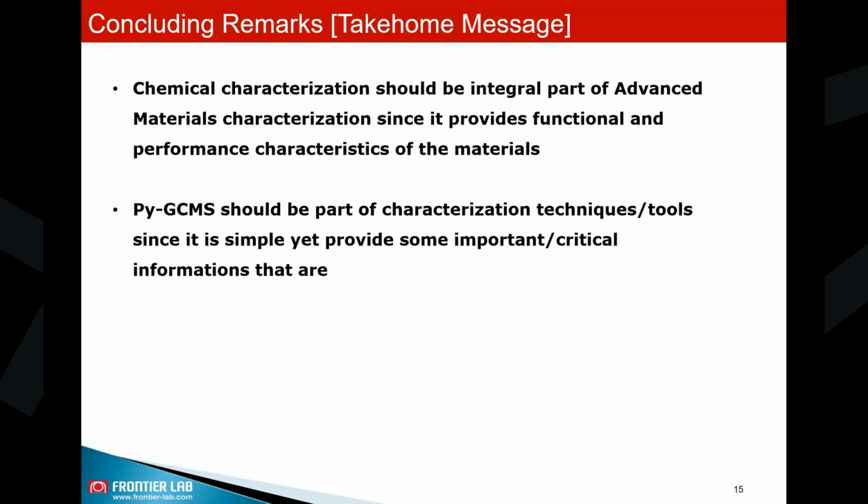Similarly, it plays an important part in failure analysis as well as reverse engineering applications, when a researcher is trying to develop a new material based on their competitor's products. Okay, so with that, I would stop here.